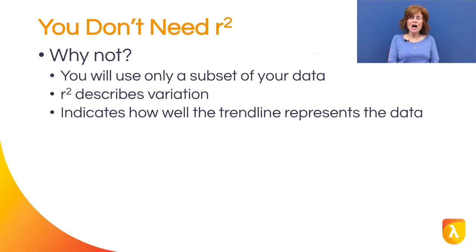Note that you do not necessarily need to determine R² for the data. Why not? Well, first, when determining the linear range, you are not going to use the entire data set, only a subset of the data. Secondly, R² doesn't tell you how linear your data set is.